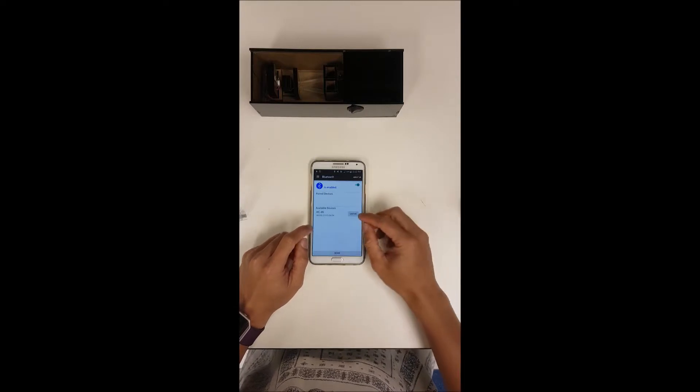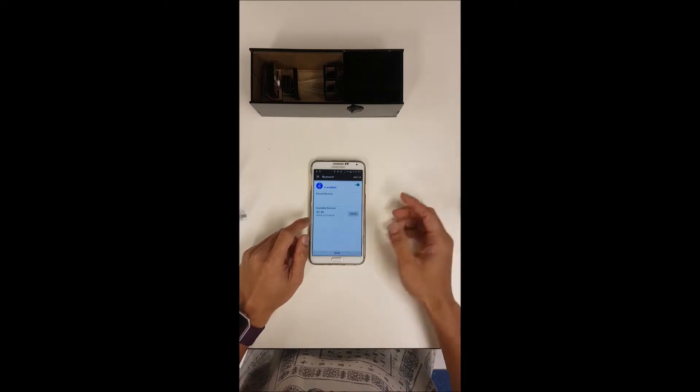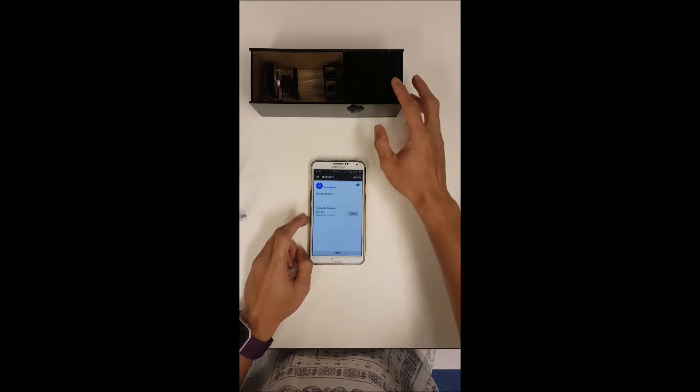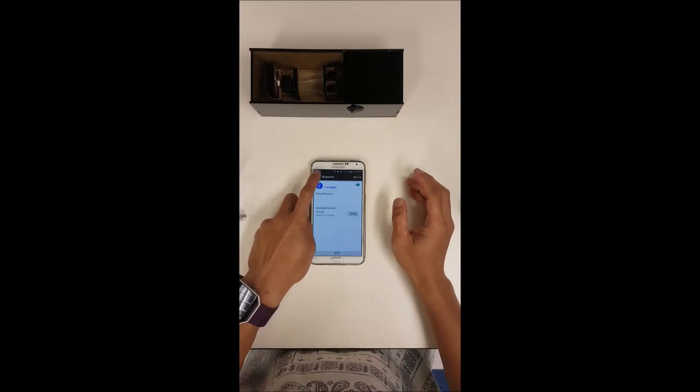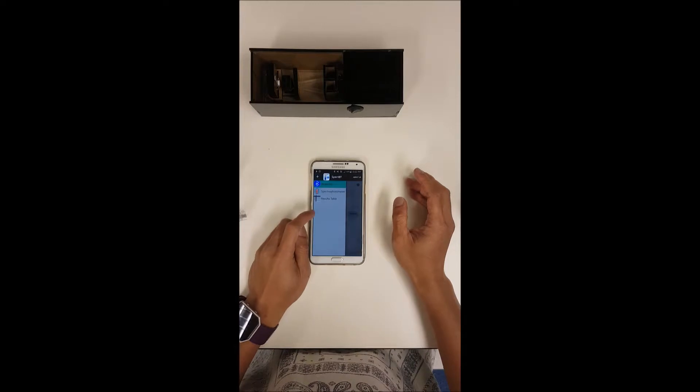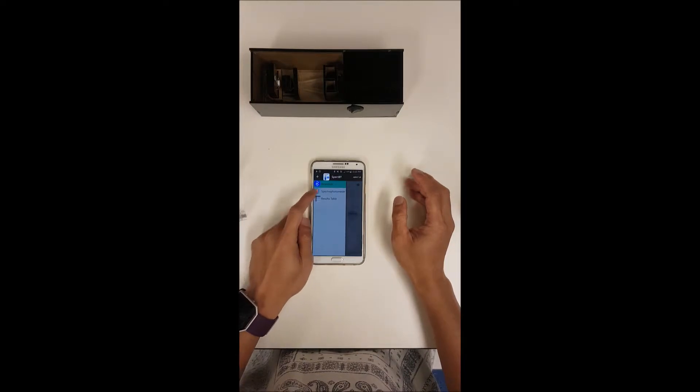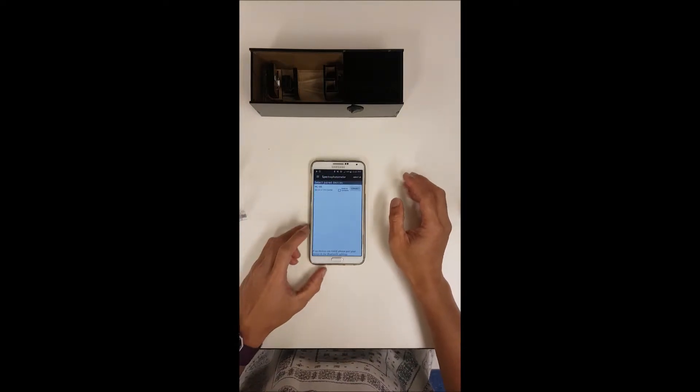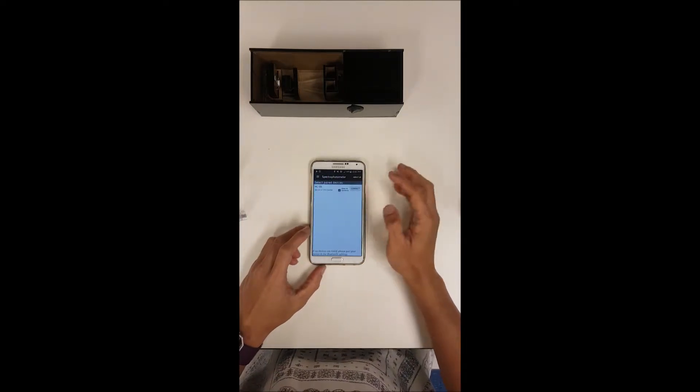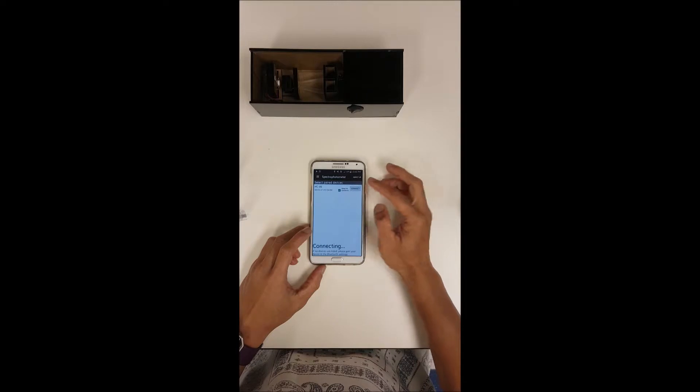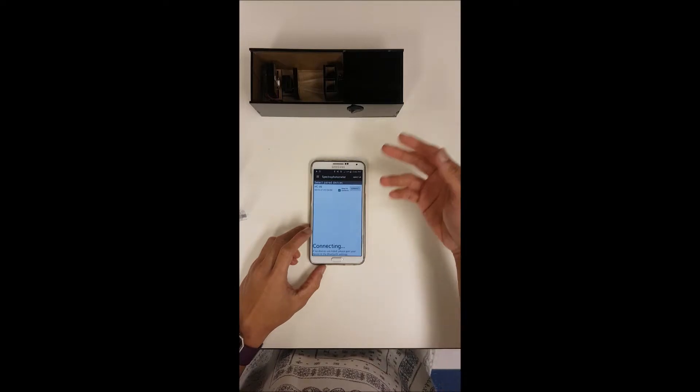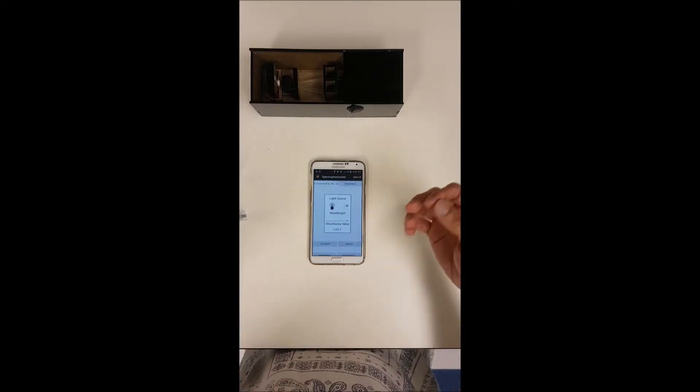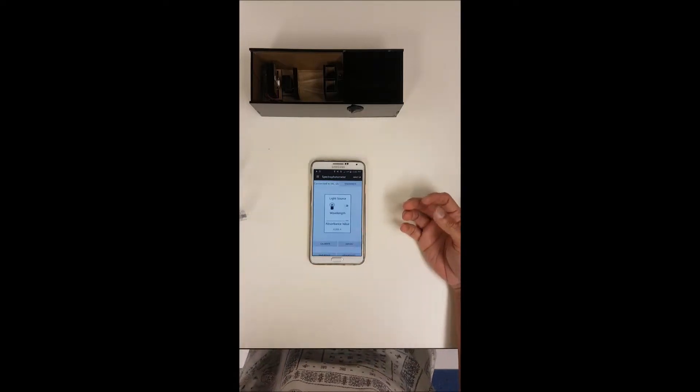Okay, once it's paired you can click unpair anytime. Click on the top left hand side menu and you can go down to spectrophotometer. Make sure it's connected all the time because the connection can drop off.